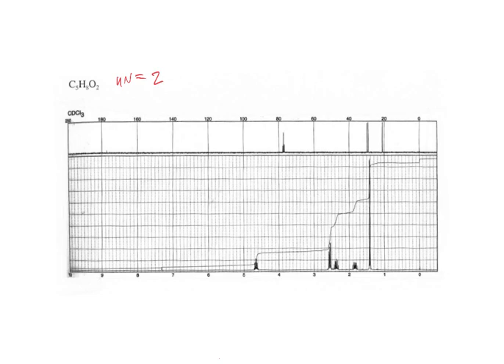Okay, so this C13, what can you see? Kind of hard to see. Is that a triplet? No, there's this peak on there, but it's also right by CDCl3. Good point. I think we have a peak right on top of the deuterated chloroform peak. So there are three peaks for the chloroform, and we have another peak right on top of it. There's also another peak down here. Well, that gives you one unsaturation. That's the ester, right? Yeah, looks like in the range of an ester.